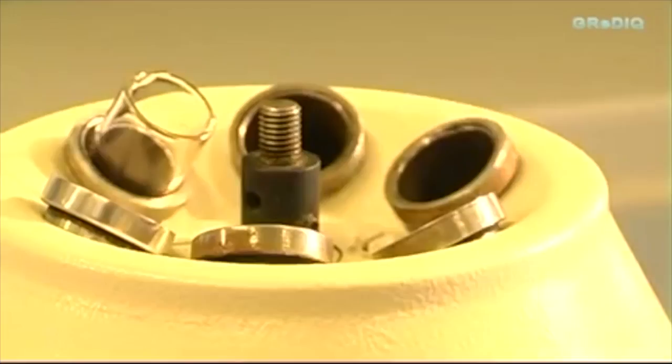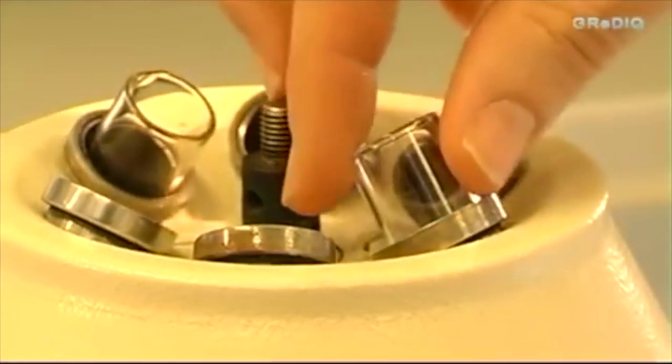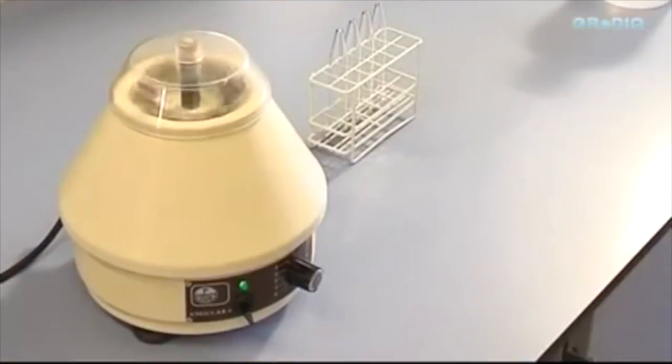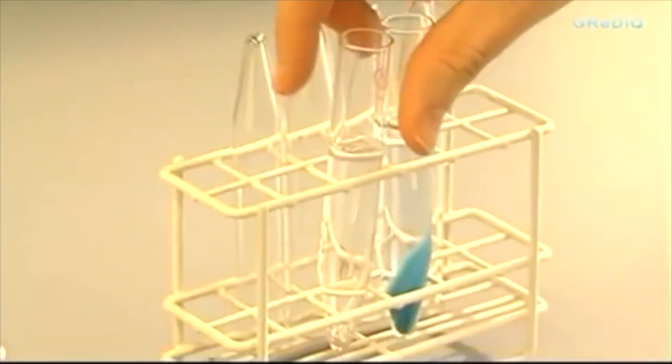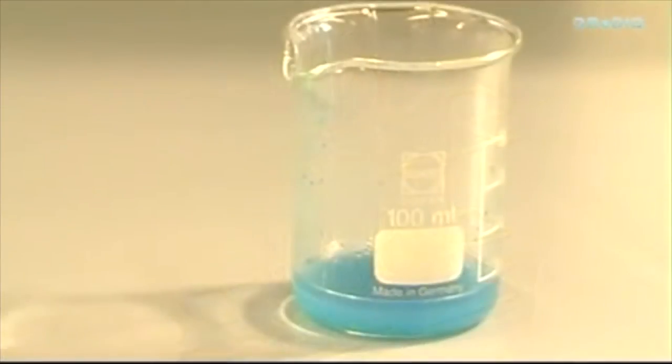Centrifugation is a separation method in which rotational speed around an axis increases the force of gravity. Thus, the faster you rotate, the greater the gravitational force will be, and vice versa. This force generates a sedimentation of the components of a specific substance, and this separation is based on size and density, where larger and denser particles are precipitated. At higher speeds, smaller components are sedimented.